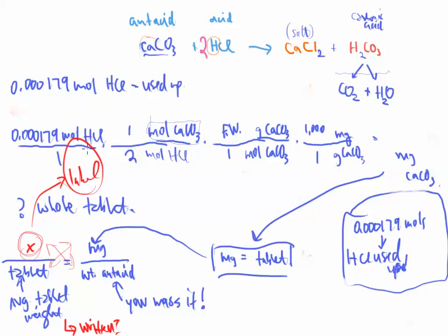So, you're going to standardize the HCl, and you need 3 samples. You're going to titrate your antacid by hand, and that requires 3 samples. And then you're going to titrate this using the titrando, and you're going to do another 3 samples.